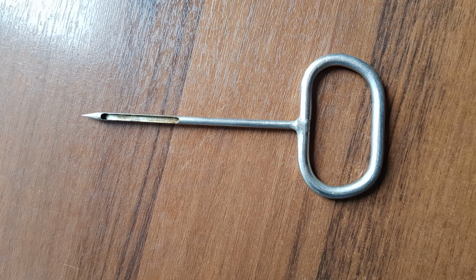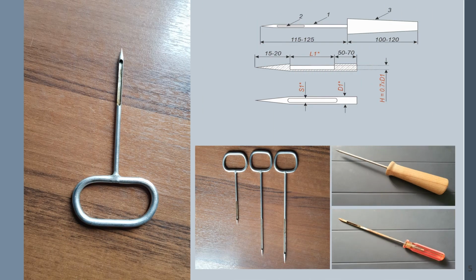The screen shows the biopsy probe on a larger scale. The key elements of the stylus design are the pointed end and the groove for picking out the eggs. Traditionally, to work with different species of sturgeon, different size probes are used, which differ in length and diameter. On the photo presented on the slide we see several variants.